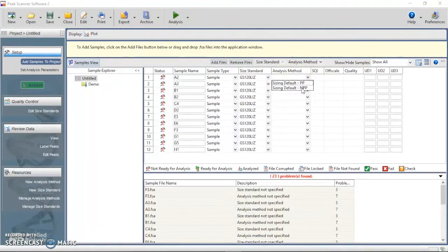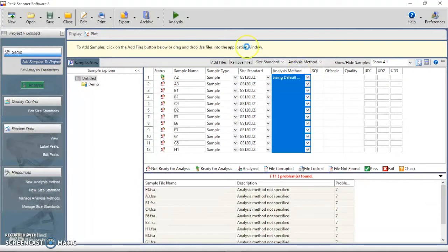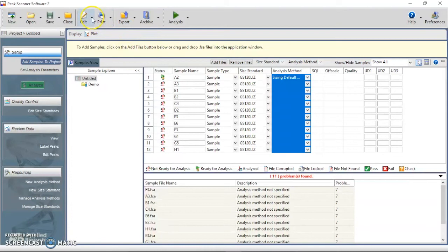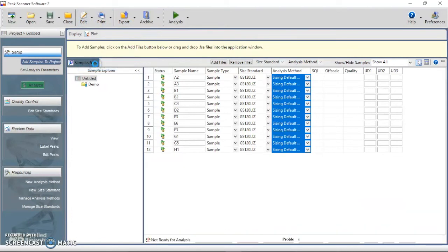Use the same method to define the analysis method. For example, Sizing Default - NPP chosen here means no primer peaks for the samples that do not contain primers.